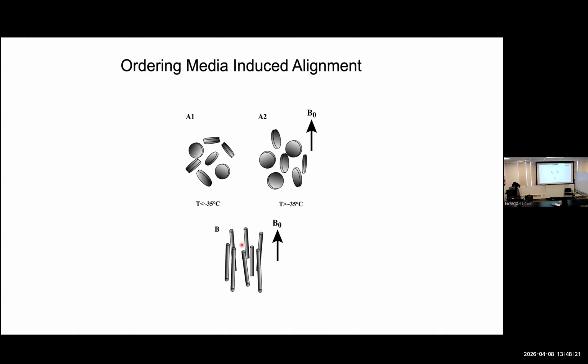Let's add this rod like that, and over here I'm sampling all orientations with equal probability, right? Now, weirdly enough, if I hit a wall as I go closer here, notice that some orientations will be rejected, right? As I get closer, more get rejected, and when I'm very close, only one is allowed. Now, in your NMR tube, you have a wall. So I'd like to inform you that all of your samples that are close to the wall are presumably partially aligned. It's just that the walls are very few in density, and so the proportion of molecules that is actually aligned is infinitesimally small.